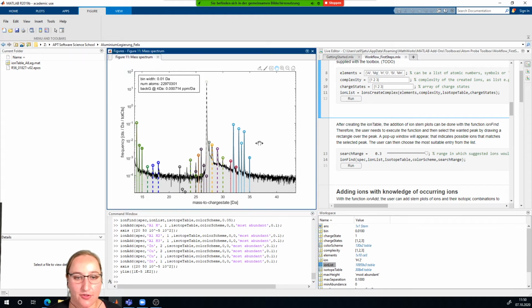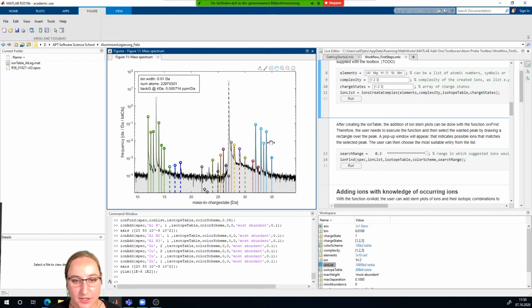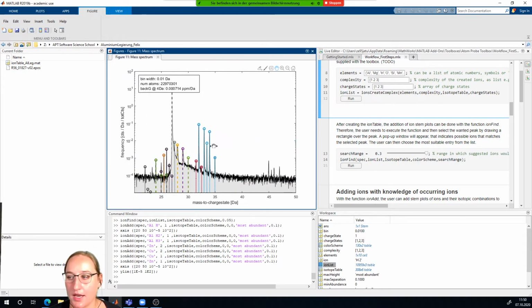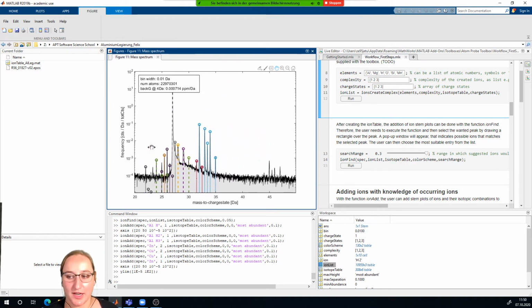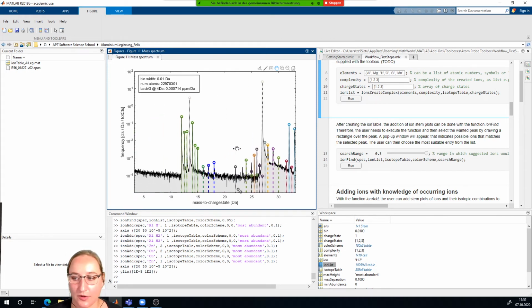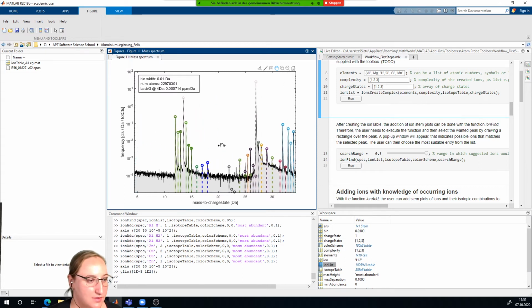Okay. Right now I would say we are about to finish adding ions to our mass spectra. Now you can add the legend here if you want. And my question to you now is, how far did you go? I hope you are all still with me. And we can also give you a few more minutes so that you can finish adding the ions.